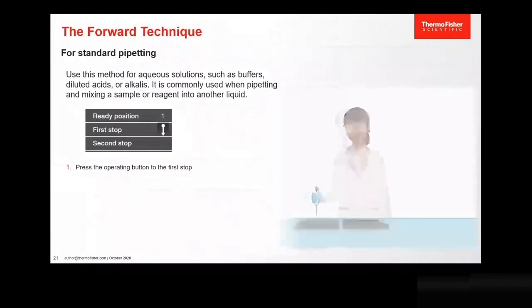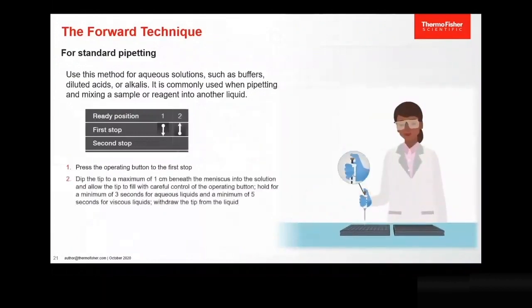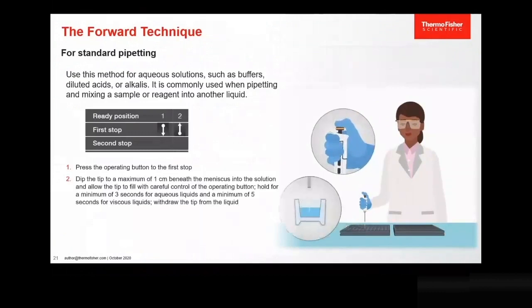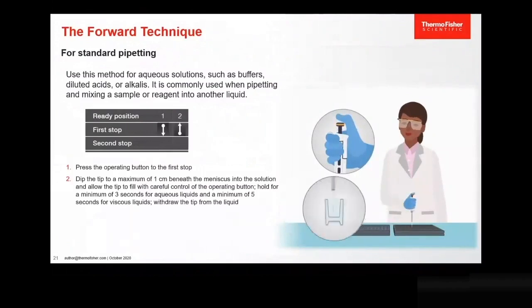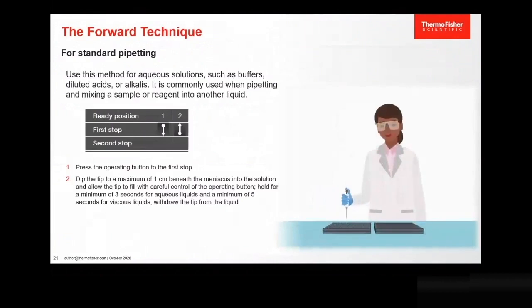Press the operating button to the first stop. Dip the tip to a maximum of one centimetre beneath the meniscus into the solution and allow the tip to fill with careful control of the operating button. Hold for a minimum of three seconds for aqueous liquids and a minimum of five seconds for viscous liquids. Draw the tip from the liquid.